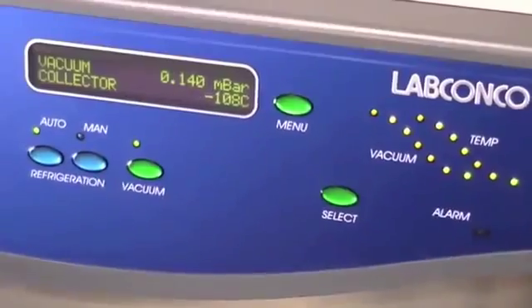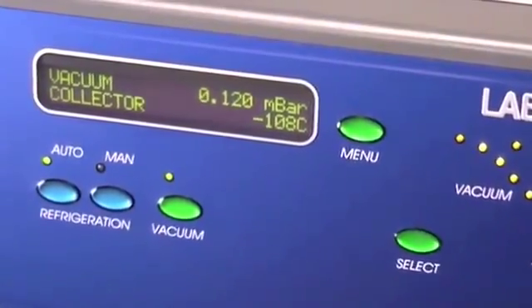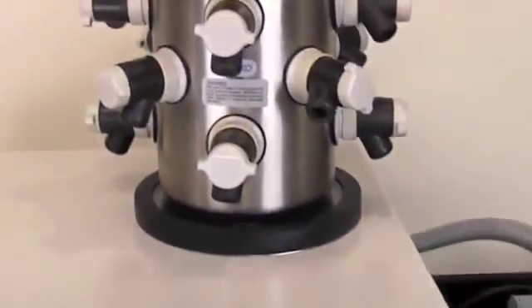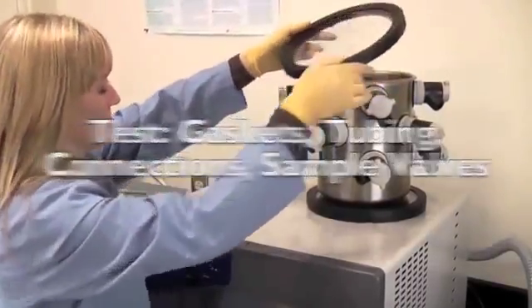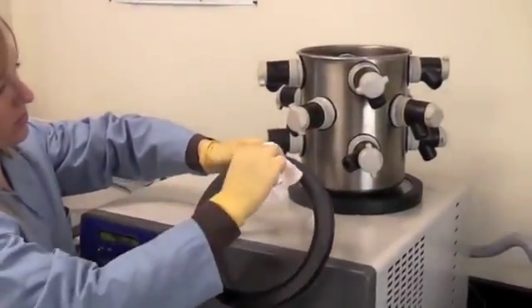LabConco freeze-dry systems should reach a vacuum of 0.133 millibars within 10 minutes and should achieve an ultimate vacuum of 0.033 millibars within 18 hours. If the freeze-dryer does not obtain a satisfactory vacuum, perform the following maintenance tests: inspect gaskets for cracks or defects and ensure each gasket is clean.